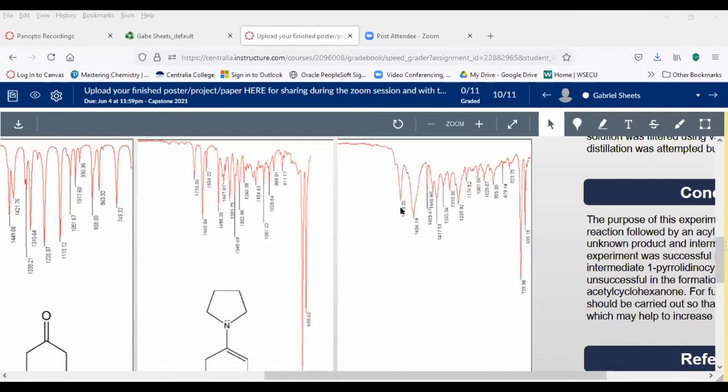It's just the scale here, this thing's a little bit broadened. So what we might be looking at here, Gabe, is a protonated amine, like when we threw the HCl at it to try to knock it off, we might have just protonated it, and that might be why this is broadened, but that would be my best guess.